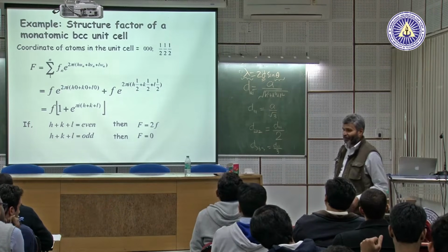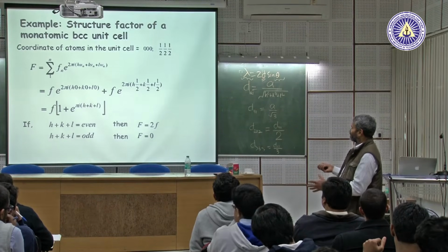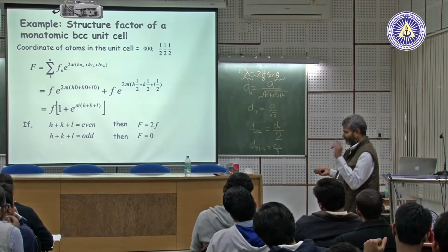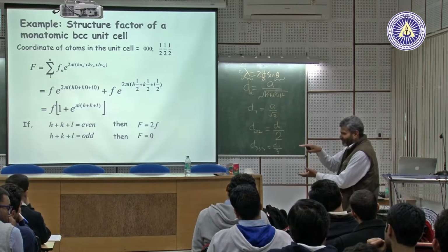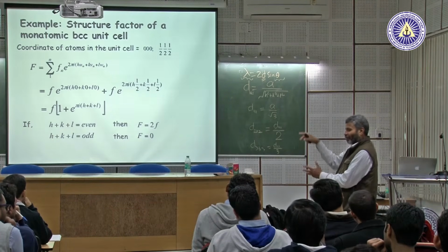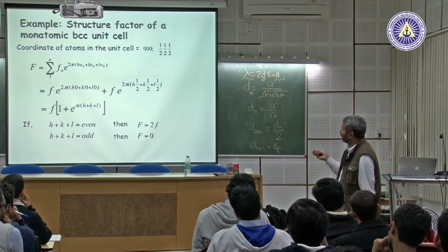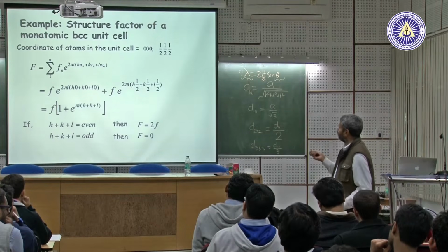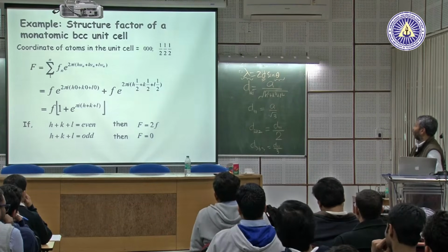It is not a big mystery, and the physics or the intuition behind that I had already shown you by the pictures. When it is saying h plus k plus l is odd, here it is coming straight from high power mathematics that the intensity should be 0. But I had shown you, at least one mental picture one should keep, that when h plus k plus l is odd, actually there is a middle atom in the crystal which we have not accounted for, and when we account for that, it will be half wavelength out, and that is what is making this 0. So, this is also actually systematically adding all the phase differences, amplitudes and phase difference. This is the vector addition of all the phasors corresponding to waves scattered by the atoms.